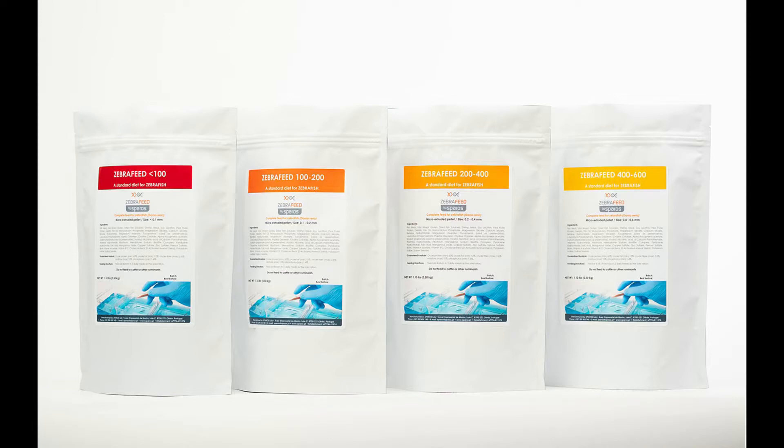One of the main aspects of husbandry is what we feed our zebrafish. We feed our fish a mixture of dry food and live food. We feed Zebrafeed by Sparos as our dry food, which comes in four sizes, and for our live food we feed rotifers.